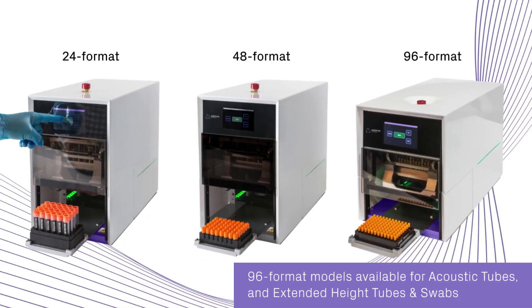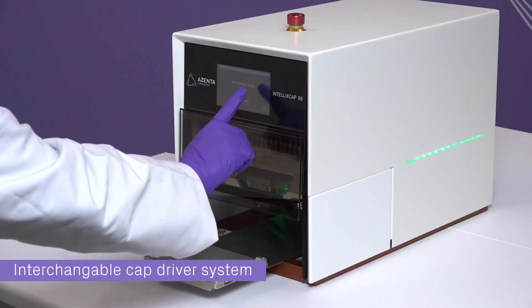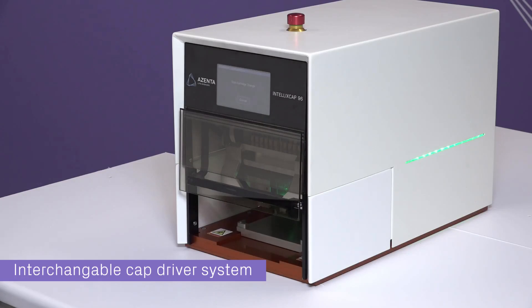Available in 24, 48, and 96 format models for SBS rack tubes, each model features a unique, interchangeable cap driver system.